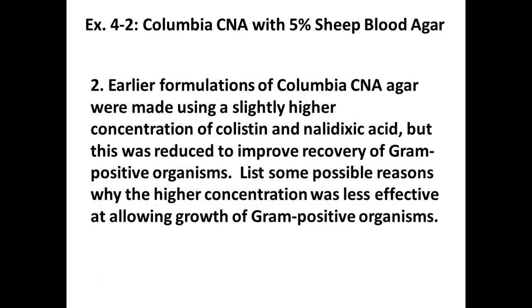So early formulations of Columbia CNA agar were made using a slightly higher concentration of colistin and nalidixic acid. So these are the two antibiotics, right? But this was reduced to improve recovery of gram-positives. What's some possible reasons why a high concentration was less effective at allowing the gram-positives to grow?